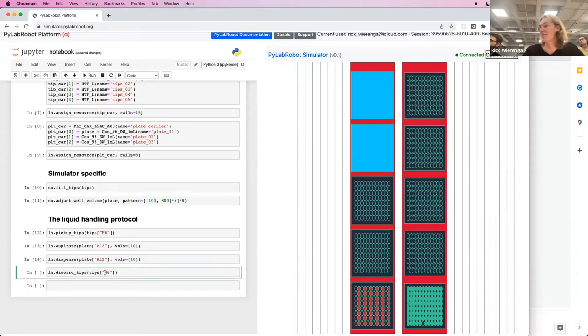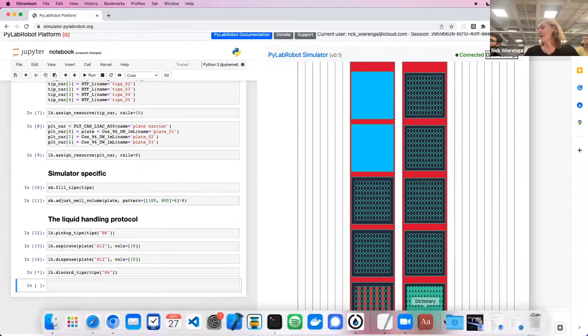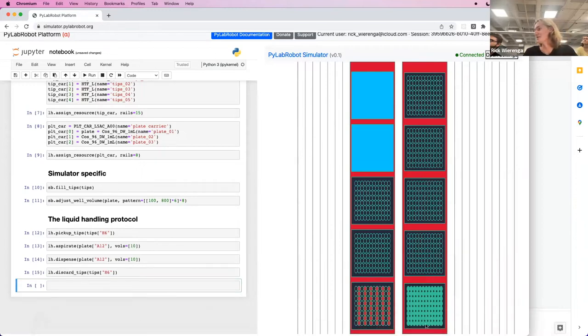And then finally, when we are done with this very simple protocol, we can put the tip back and you will see it reappear at the bottom here.